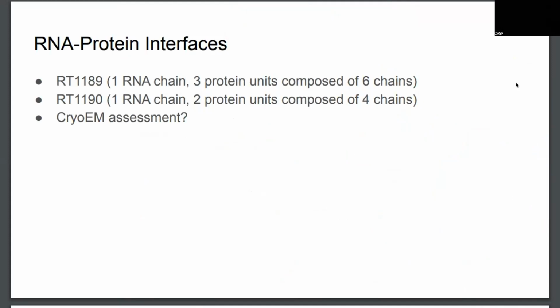Okay, and the final data I was planning on looking at was the RNA-Protein Interfaces, and the idea was to do some CryoEM assessment.